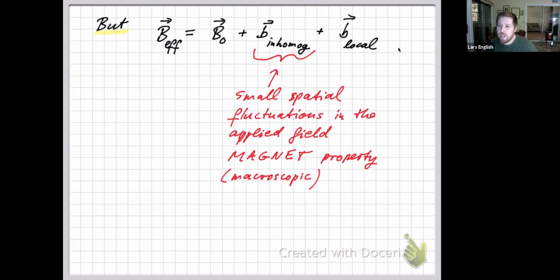It's basically just a feature of the magnet that you're using. It can produce a fairly homogeneous magnetic field. And if you put a lot of effort into it, then maybe the homogeneity is pretty good, but there's always going to be some residual variation, spatial variation.